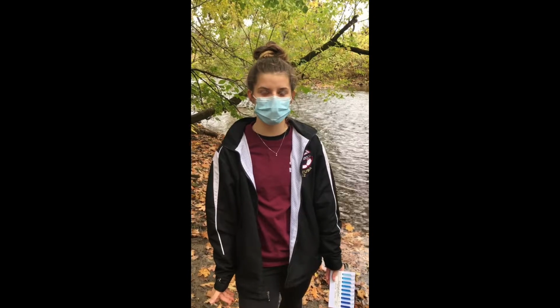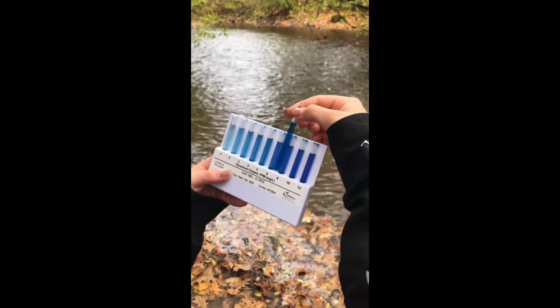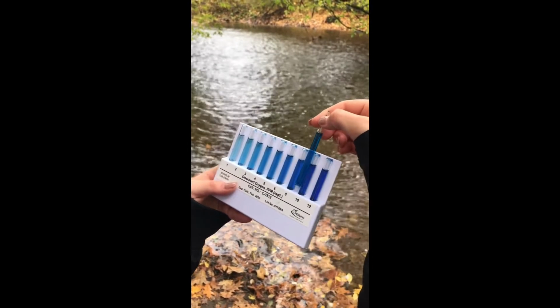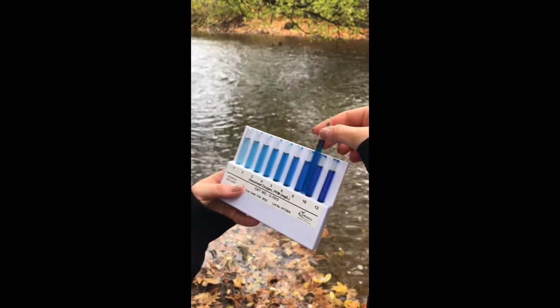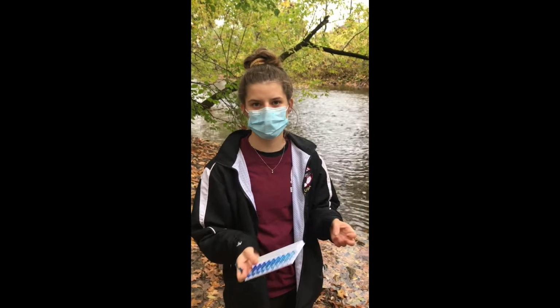After you've waited a couple of minutes, you can then compare your sample taken from the stream to the samples provided by the test kit. You want to compare the color of your sample to the colors provided and determine the oxygen level. As you can see, the ampule we collected is between 8 and 10, which means the dissolved oxygen level is around 9, which is a good measurement for the stream.